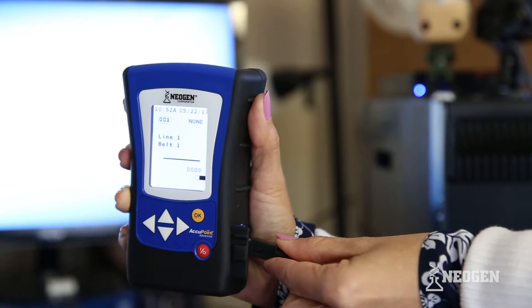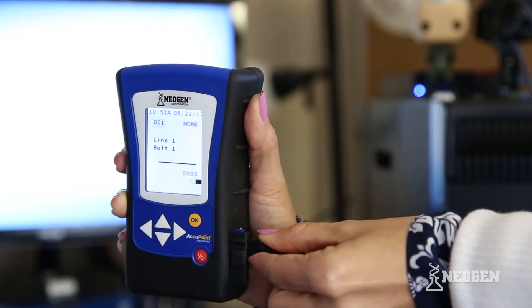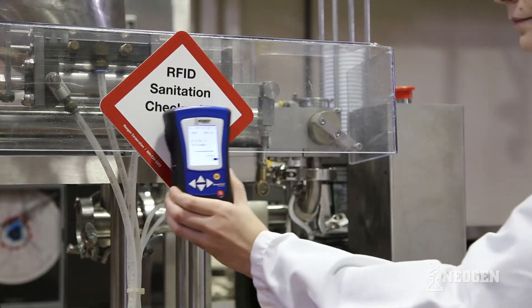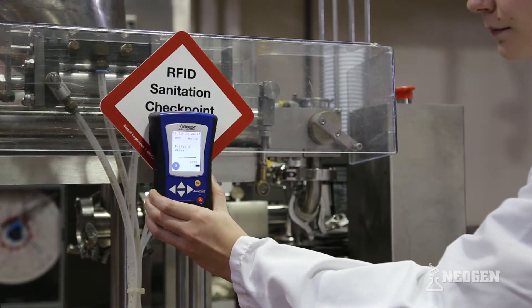With Accupoint Advanced and its software, it's easy to create a testing plan and sync it to the reader. Once synced, swiping the reader over an RFID tag automatically populates the test site information.